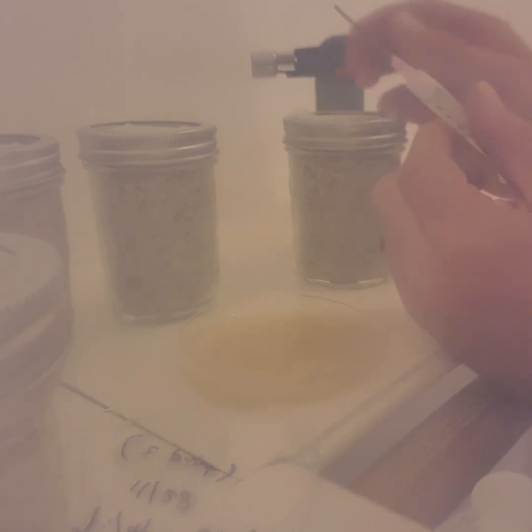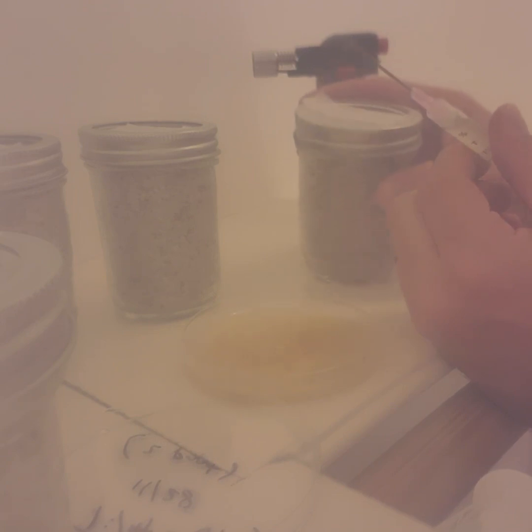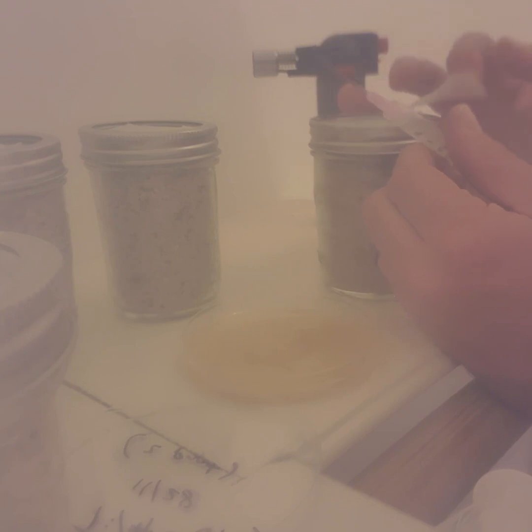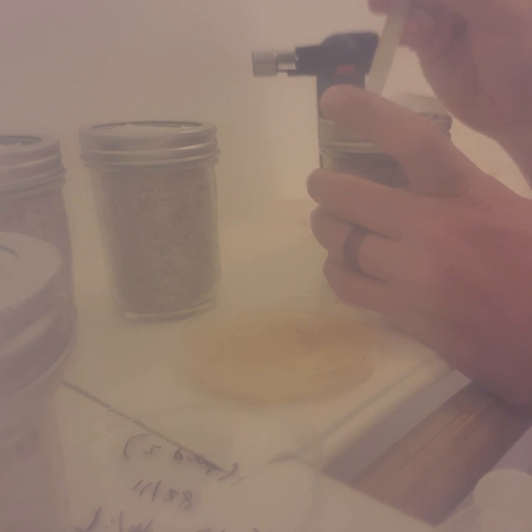I drilled two holes in the lid of these jars and I've got some micropore tape on top. I'm just pulling the tape back — these were sterilized yesterday — and I'm just sticking it in and injecting it.